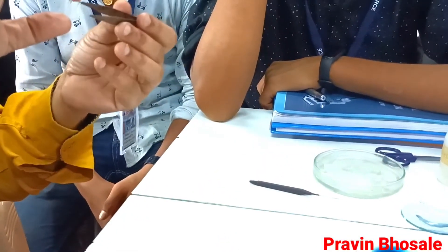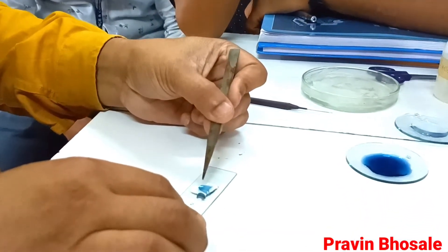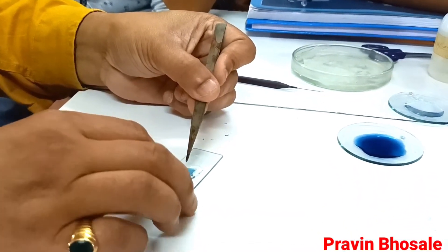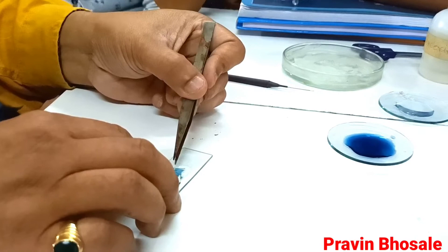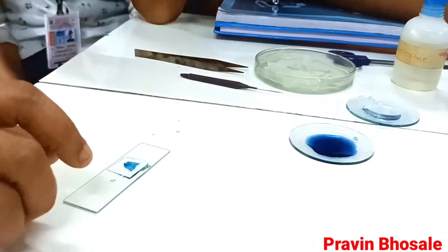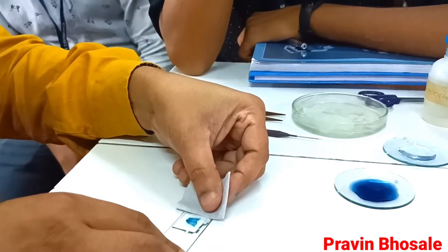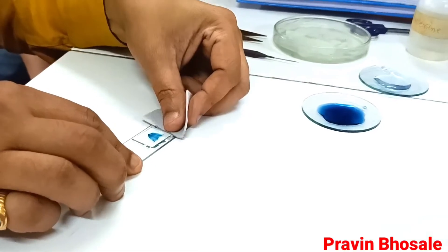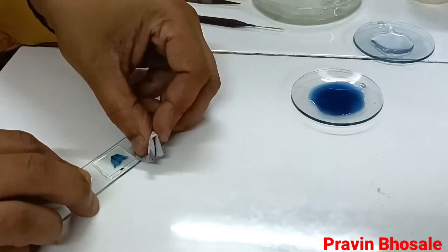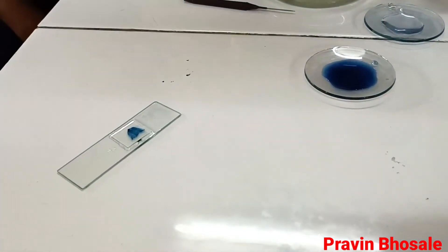Now next is to place the cover slip. Hold the cover slip with the help of a forcep — one end of the cover slip should touch the slide — and slowly remove the forcep. When you place the cover slip, the excess glycerine comes out. Remove it with the help of blotting paper. See that your slide is clean and dry. So the slide is ready.